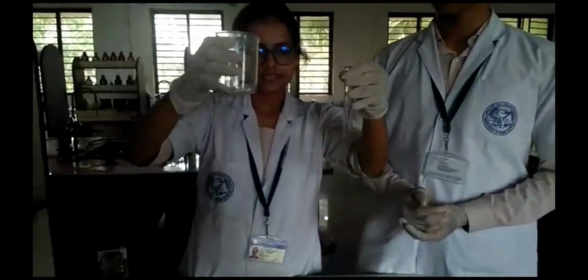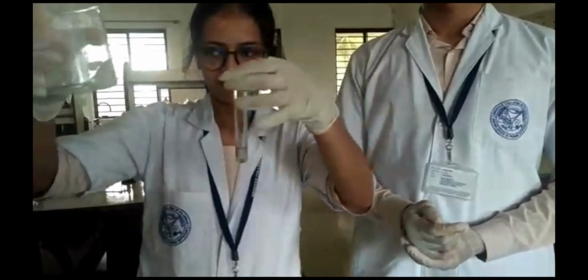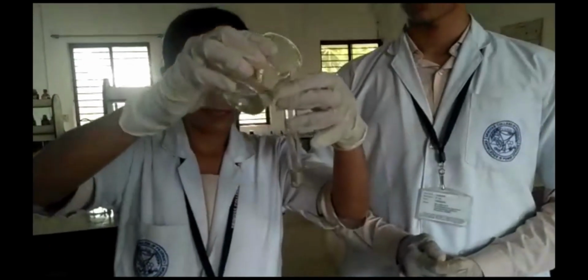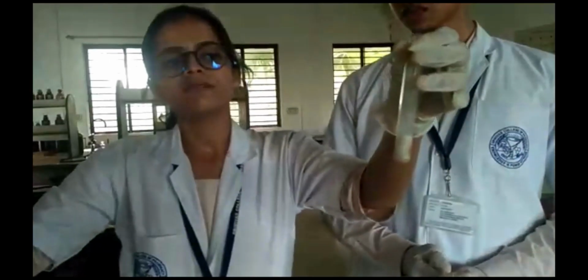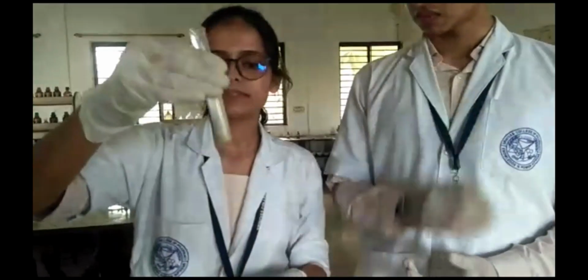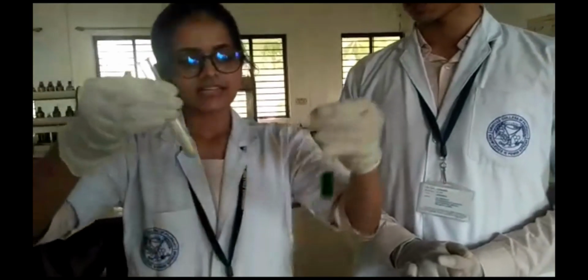Now I am going to make barium sulfate precipitate. For this I am going to mix barium chloride solution with dilute sulfuric acid. I am taking barium chloride solution in this test tube. Now I am adding dilute sulfuric acid to this, and this will form a white precipitate. And I am going to add this white precipitate to this green glycerine layer.